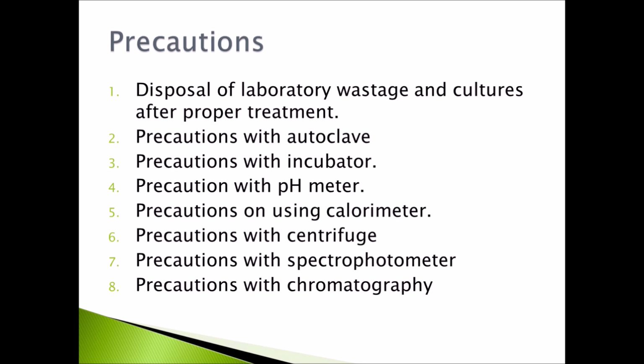Now, use of safety cups whenever possible. Disinfect weekly after all spills or breakages. Lubricate O-rings and rotor threads weekly, and do not operate the centrifuge without the rotor properly balanced.